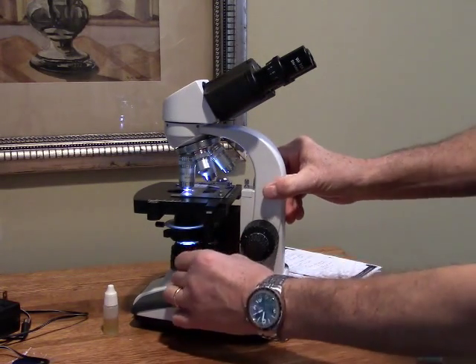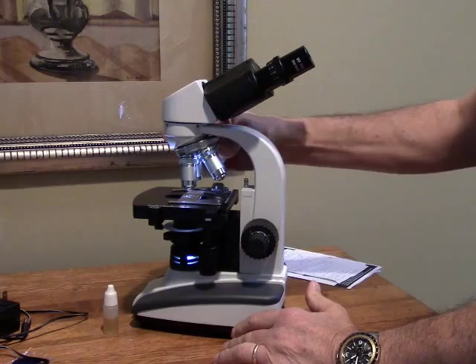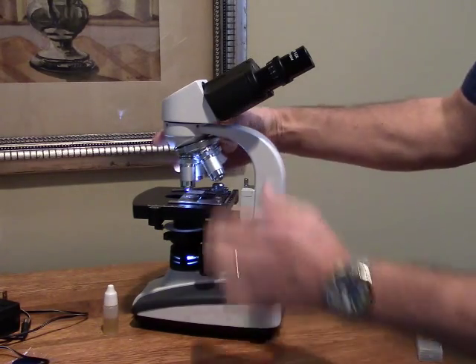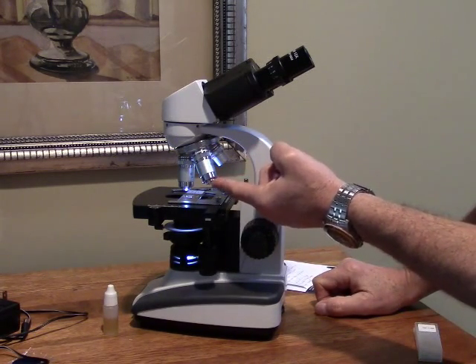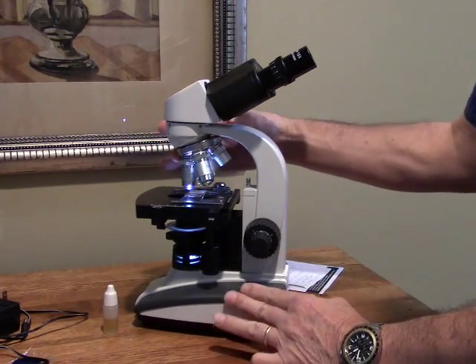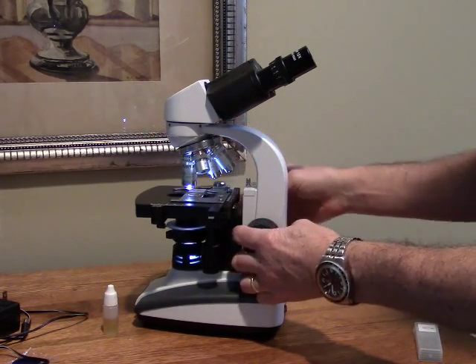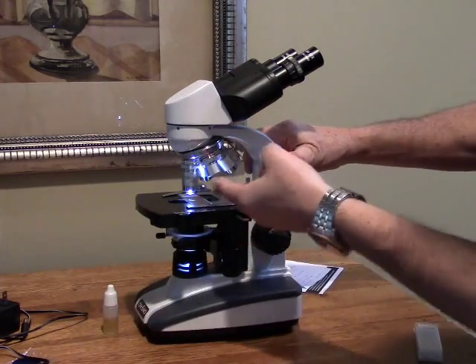With objectives of 4x, 10x, 40x, and 100x in conjunction with the 10x eyepieces, that gives you 40x, 100x, 400x, and 1000x total magnification. The 40x and 100x objective lenses have a spring-loaded tip, which is really helpful especially for less experienced users — it helps prevent breaking a slide if you don't have your stage set just right, or if you're doing a coarse focus and not paying attention and could snap a slide right in half.